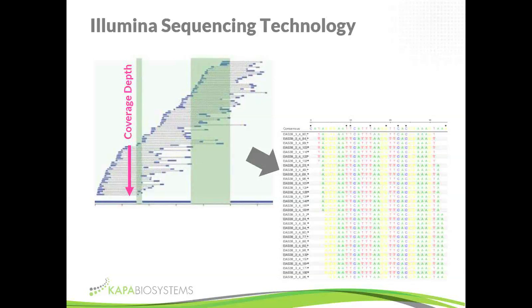If, for instance, we want to identify with confidence small, very rare cancer populations against a background of normal cells, or we're looking at rare mutations and rare allele frequencies associated with different diseases, the strategy there is to sequence a smaller genetic unit, but to much, much deeper coverage. And so coverage depth is really important, and different types of projects have different requirements.